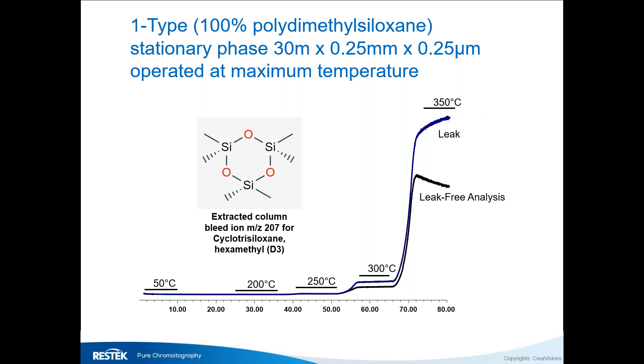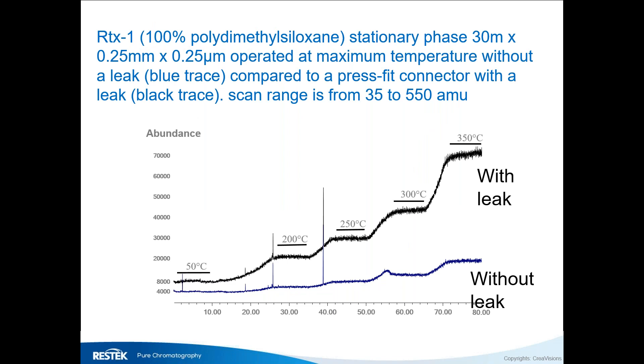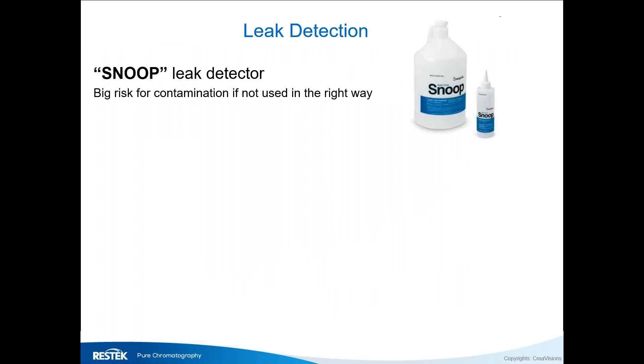Normally you should see the baseline go up and then plateau — that's normal behavior and tells you there are no leaks. You'll also see a higher absolute baseline offset if there's a leak introducing water or oxygen. Leak detection is important, and while you can use Snoop leak detectors, that's not really the best way — there are better options available.